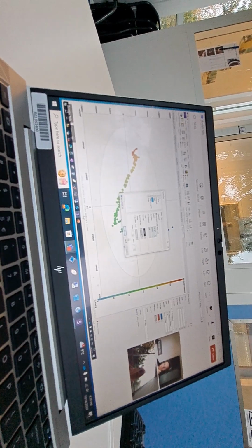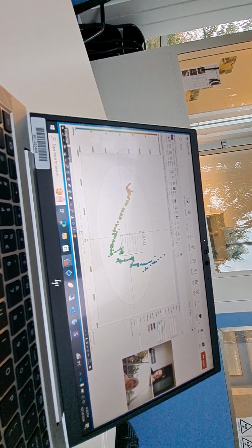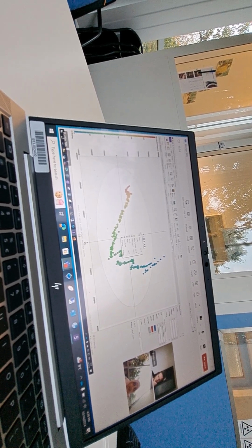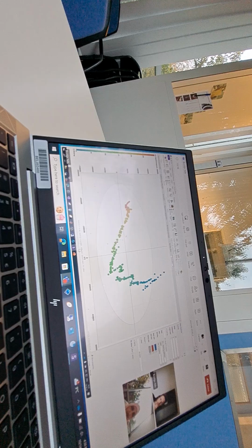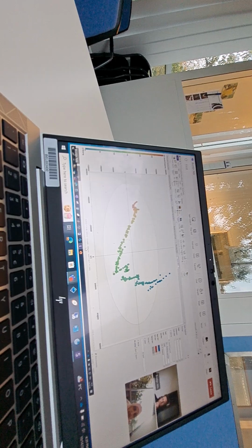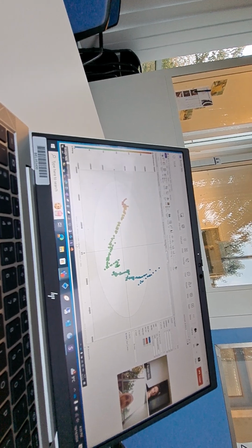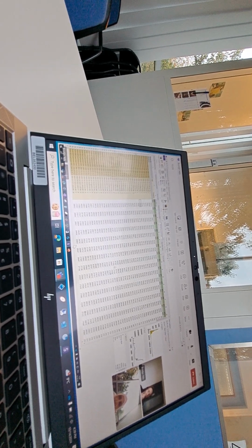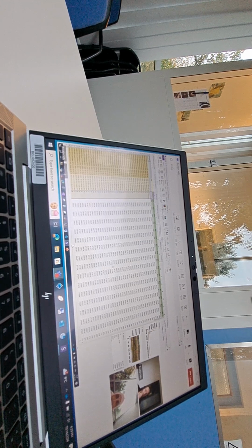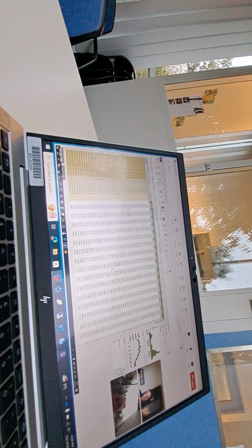And one more thing, because I was using pH, time and Raman, the three things. If I want to mix three variables together, will I be able to? Is there any option? Oh yes. You mean that you can color not only according to the time, but to the pH as well? Is that your question? Yeah. For example, if you import your data here, we created a secondary ID time point. But if you want, you can create one with the pH. Okay, fine. That was my question.